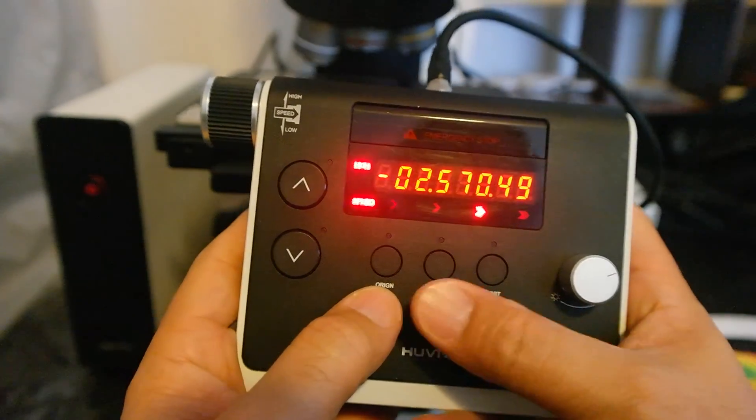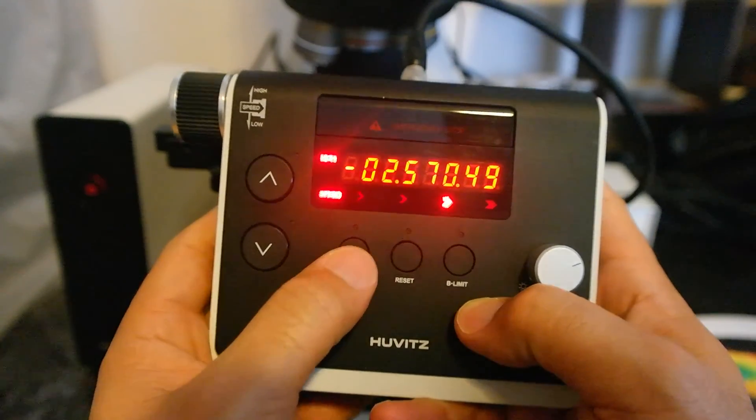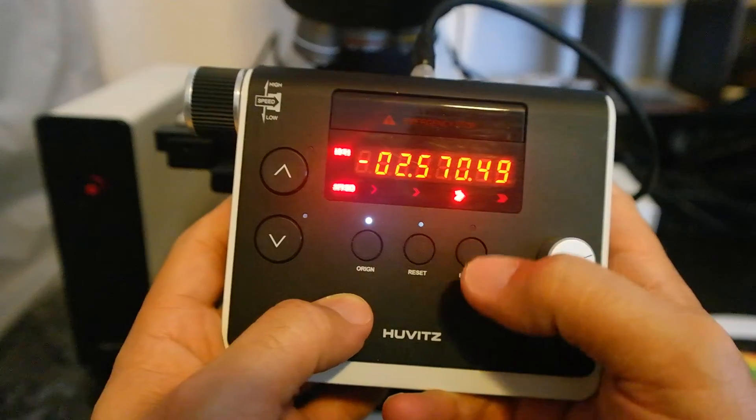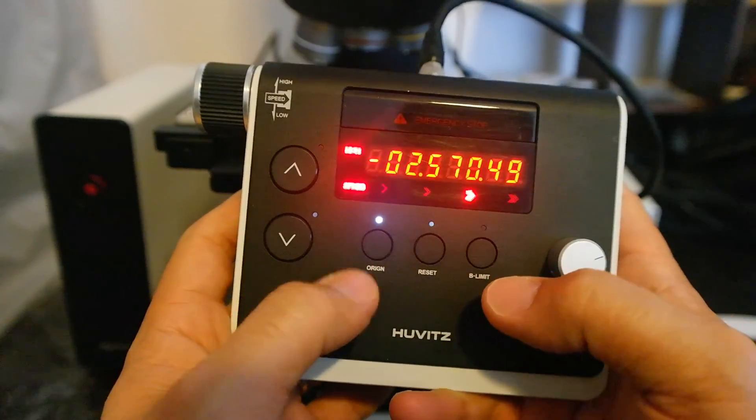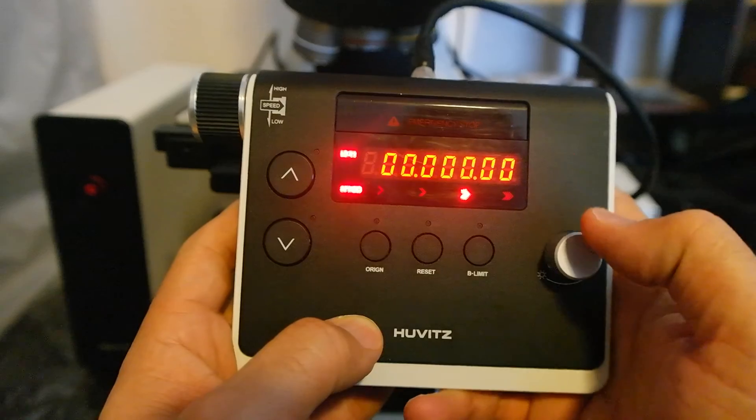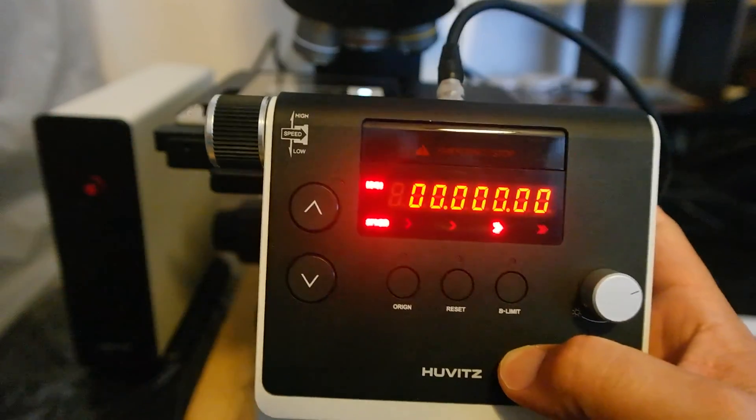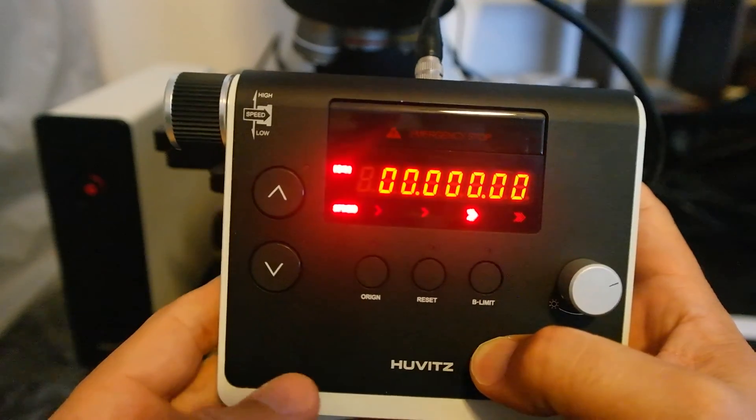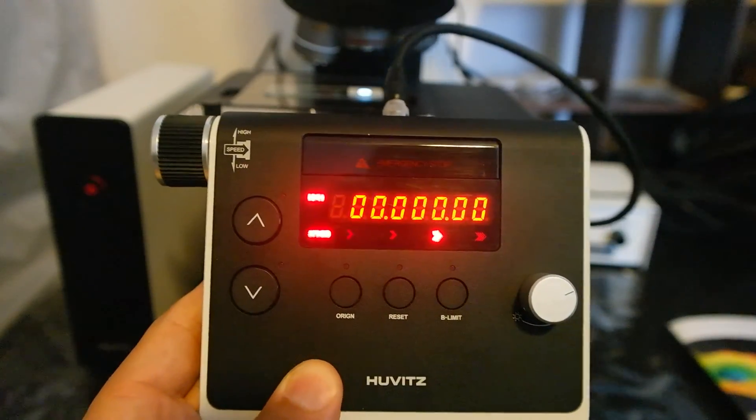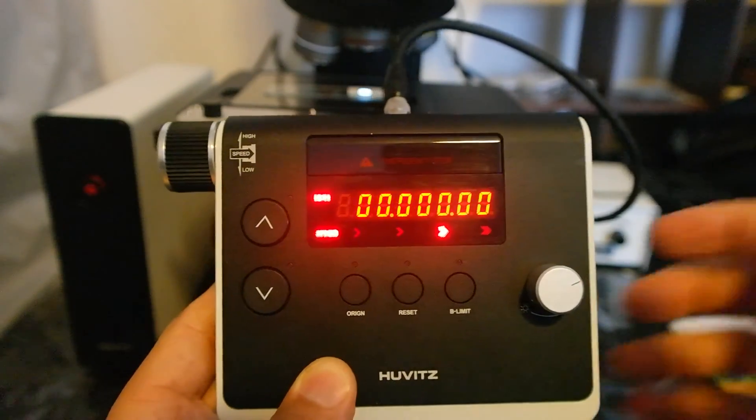And here are 3 buttons: origin. So you can say this is the origin and it will remember that origin. You can reset it so everything will be 0. The B here is the bottom limit, so you can define the limit of bottom and it won't go lower than that.